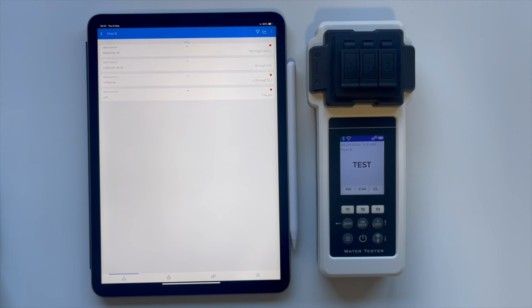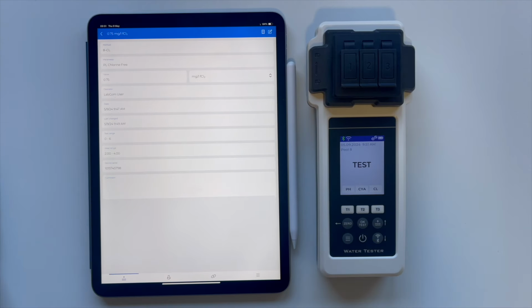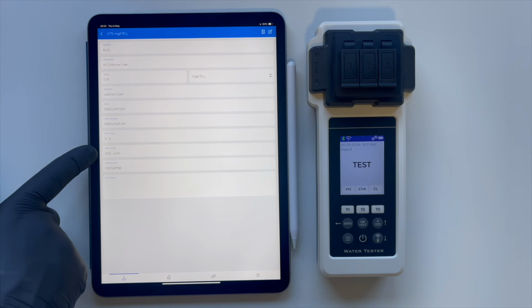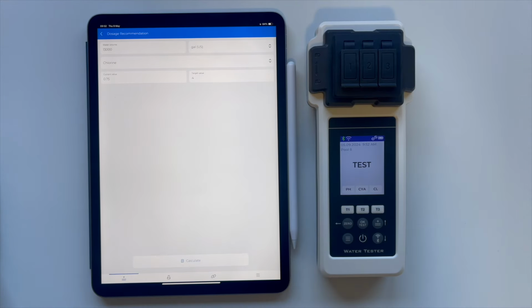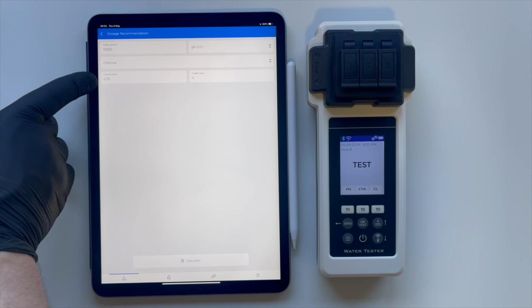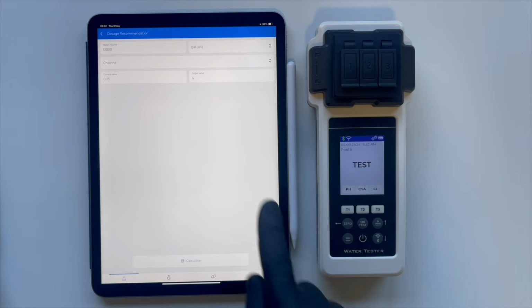Let's look at chlorine. We see that the chlorine level is 0,75, with an ideal range between 2 and 4. This indicates that the chlorine concentration in the water is insufficient according to the standards we've established for maintaining optimal water quality and safety. We press the calculator. It shows us the pool volume, the measuring parameter, the current chlorine level, and the desired target level.